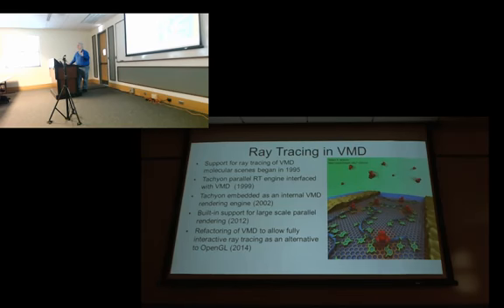And rasterization can draw, in particular, things composed of zillions of triangles very quickly, but historically at limited fidelity. They make a lot of trade-offs in the algorithm to be able to draw things rapidly, but at the expense of visual quality and lighting fidelity and things like this.